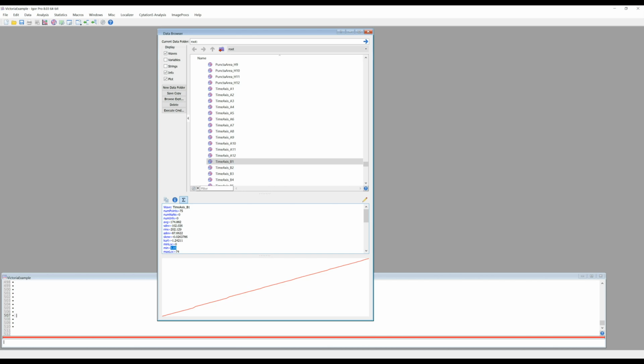What that means is that the well B1 was imaged 1.05 minutes later than well A1. So it's just to make a point about that exercise of extracting the timestamps from the movies in order to make the graphs against the real elapsed time values instead of making the graphs against the number of frames.